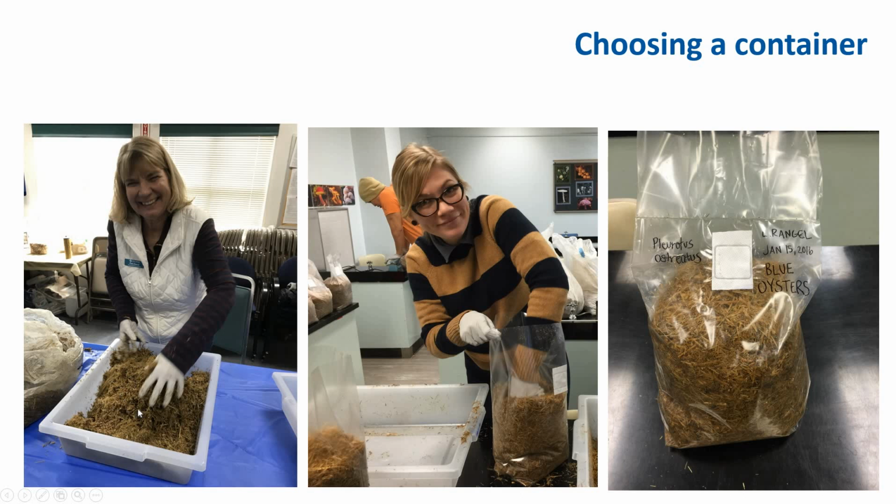So basically, you mix the spawn and the straw together, and then the next step requires you to purchase plastic bags with a filter patch designed to grow mushroom. These bags are easy to find online, so please go to your search engine and look up mushroom filter bags. You can find them on Amazon, eBay, any store online. Each mushroom bag has a filter patch about 2 inches square.